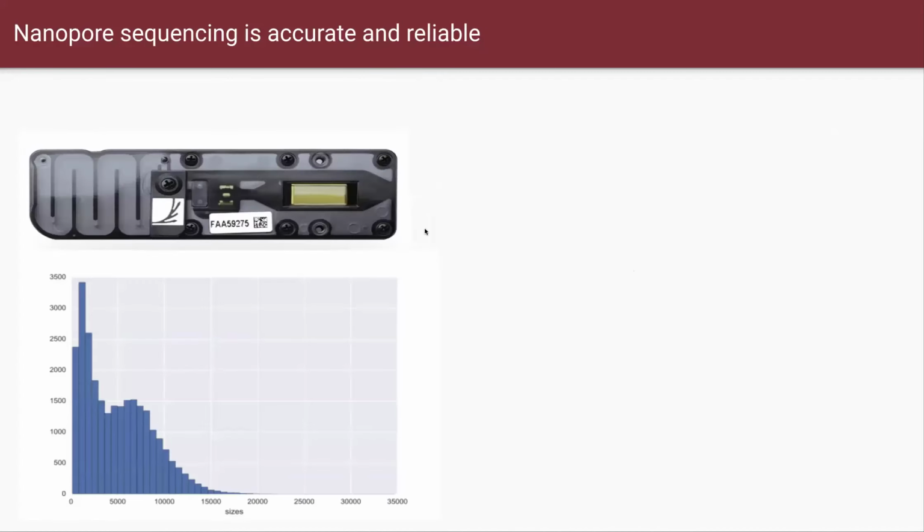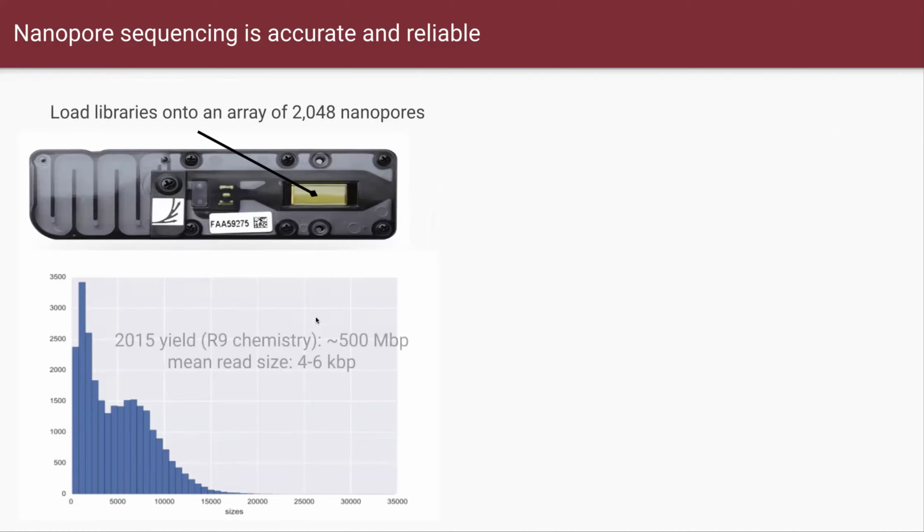Nanopore sequencing can also give you longer reads than Illumina, and is quite similar to PacBio. I mean, the example is not that exact. I heard it can go up to around a million base pairs, I guess. It's quite useful.